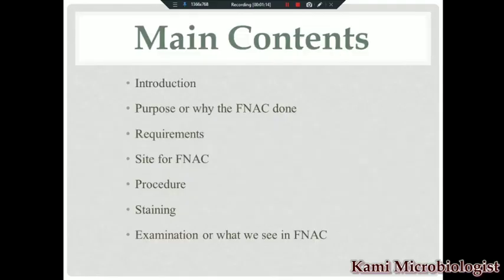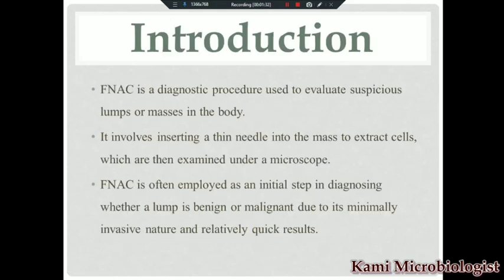Now in this video we are going to explain the introduction, what fine needle biopsy is. We are going to see the purpose, the requirements, sites for fine needle aspiration, procedure, staining, examination, and what we can see in fine needle aspiration biopsy. So first of all, let's start the lecture with the introduction.